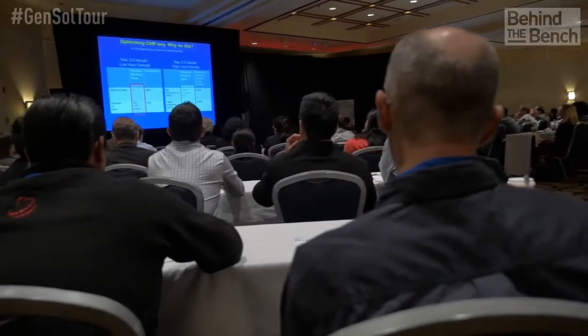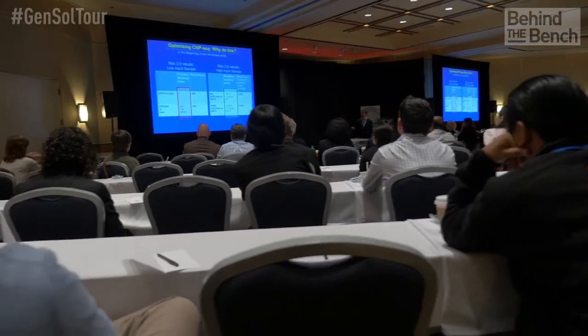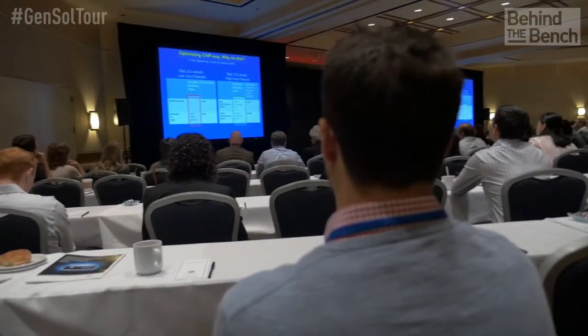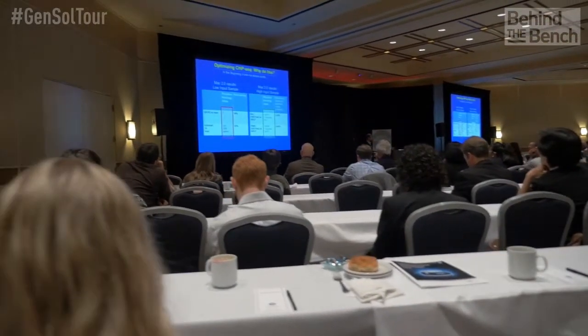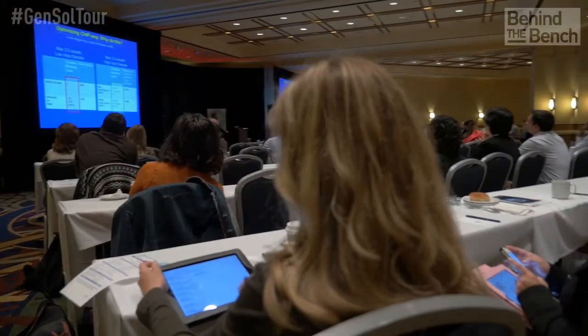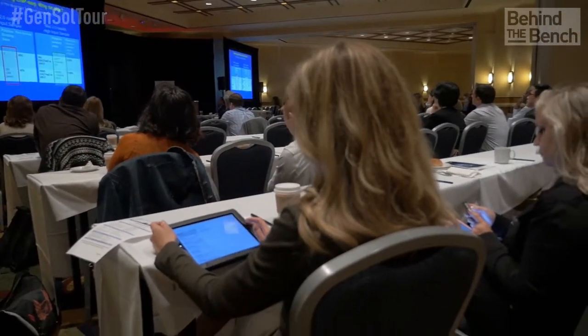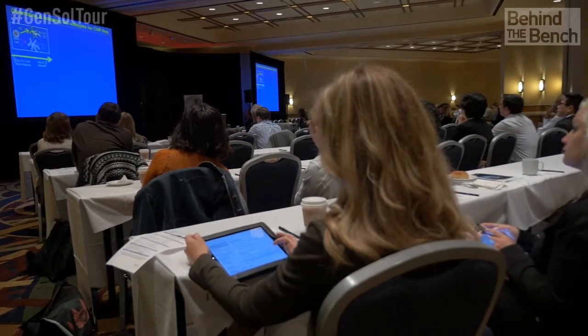And you showed some data regarding your early efforts at ChIP-Seq on the Ion Proton. What can you share about that? Yeah, so this is tremendously exciting. ChIP sequencing is a process where we can create what we can call an epigenetic signature in specific cell types. And these signatures really point to places in the genome where there's an environmental event, something that's happened to the genome from an environmental exposure. And so using the Ion Proton technology, working with Life Technologies, we've been able to optimize this process called ChIP-Sequencing.